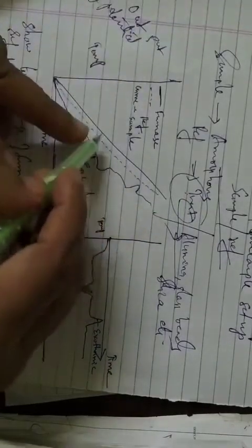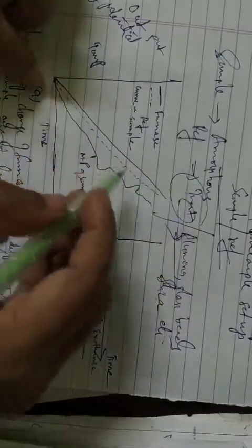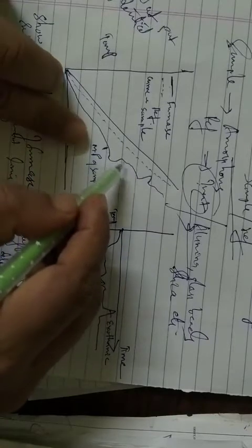Okay, so like this you can see the two graphs we are using here. In the furnace, we have the atmosphere, which stays constant, and the reference we are taking is also inert in nature, so it comes to the furnace as a little straight line. But whenever the sample is considered, we get two signals here, the downward peak and the upward peak.